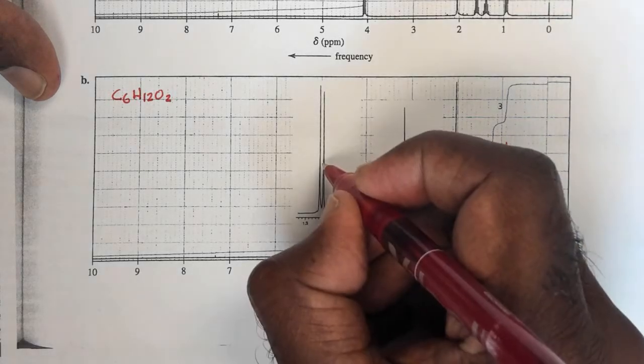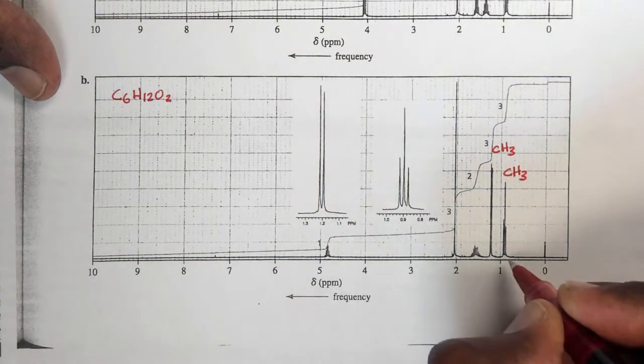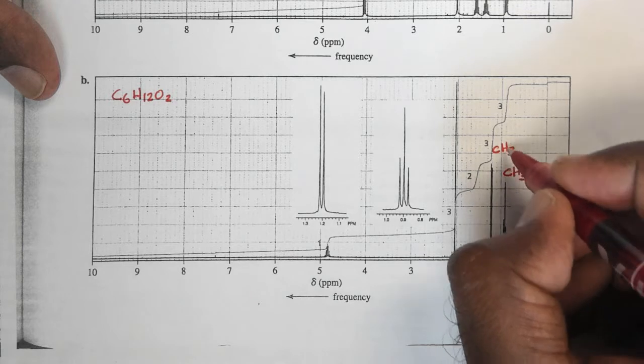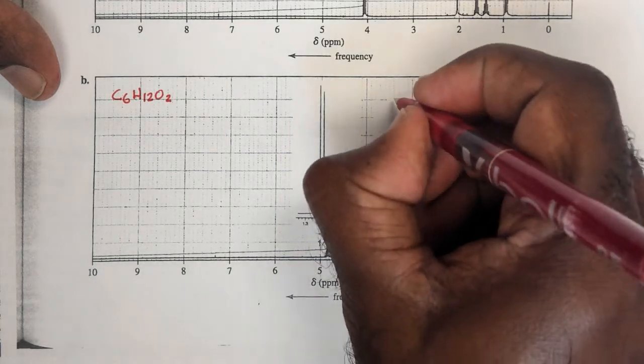These two are the typical methyl region of the spectrum, but this is a doublet. You can see the expansion here, 1.2, 1.2, 0.9, 0.9. So this is a doublet, and that's a triplet. And just using those two facts, both of these resonances are CH3 groups.